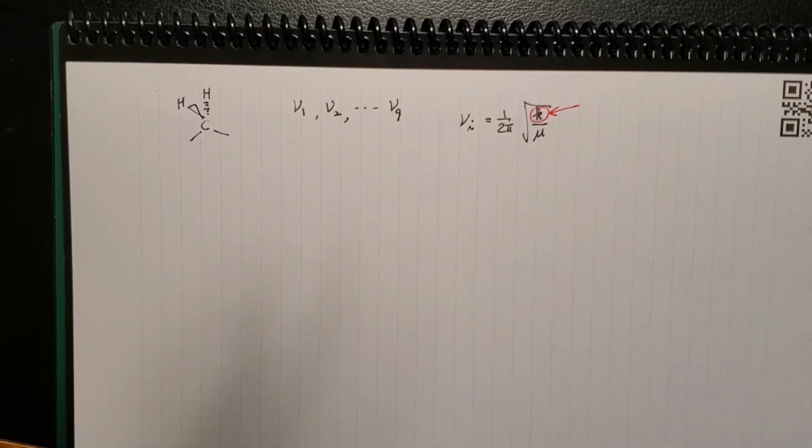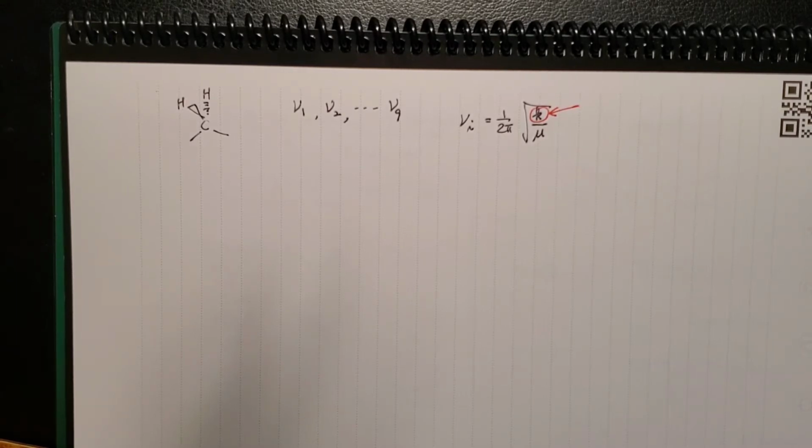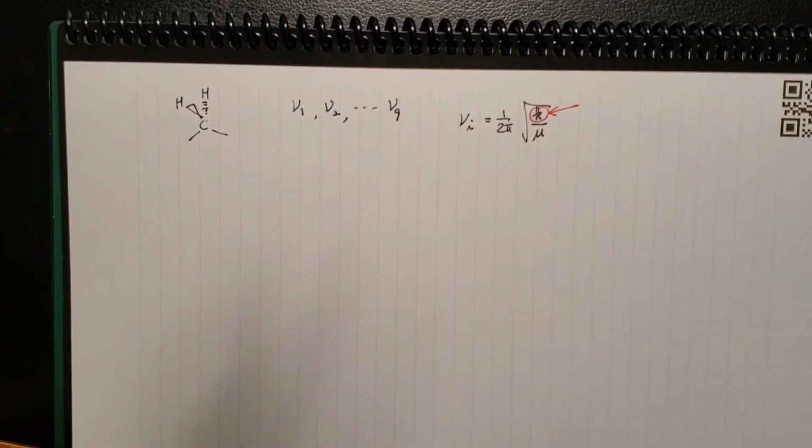In application, for example, if you are doing a docking experiment of a drug or a substrate with a certain enzyme, when the molecule is free in a solution like water or blood, the CH2 is rocking freely, for example, in one mode, right?